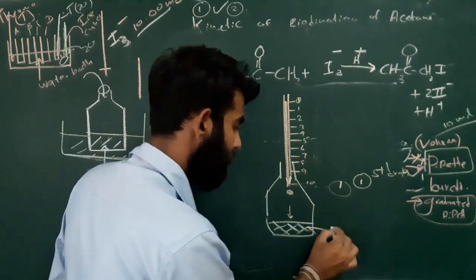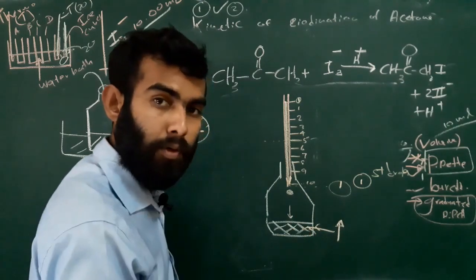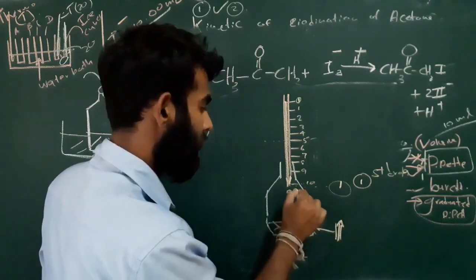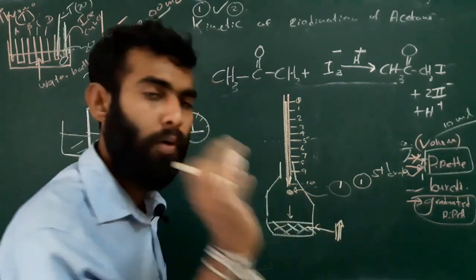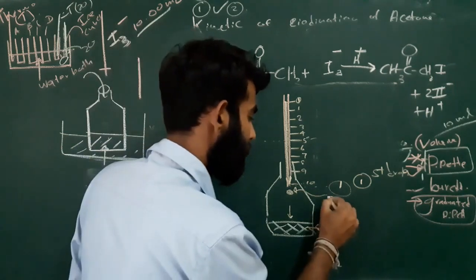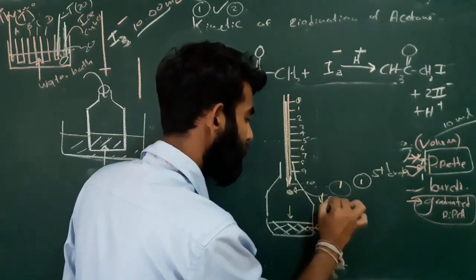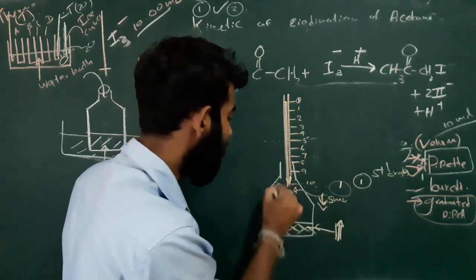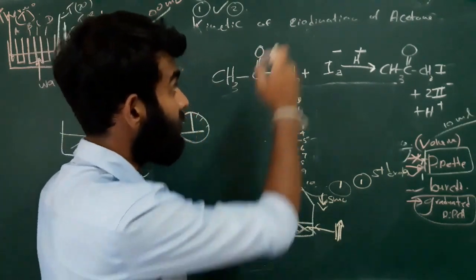Here this reactant is very high in this bottle. The reaction mixture contains a very high concentration, and in contrast to that, this first drop contains a very small amount of iodine. Its amount is very low compared to this second reactant. This is the first reactant, iodine, and this mixture is the second reactant. When they mix, the reaction will start.